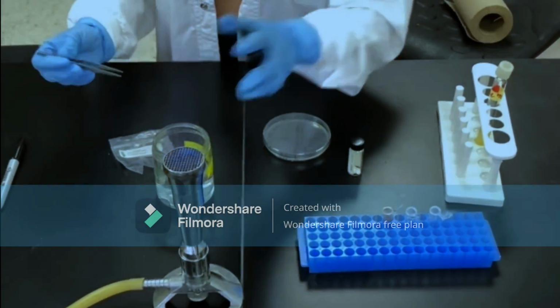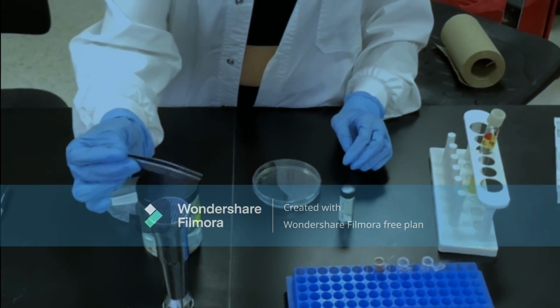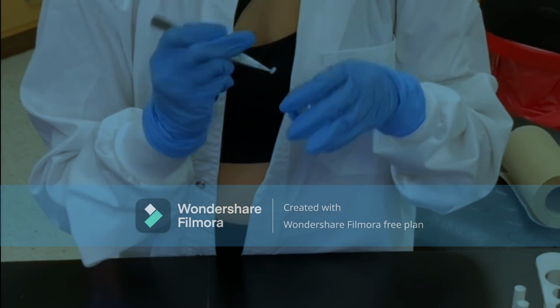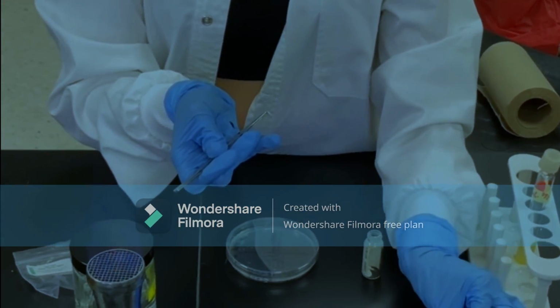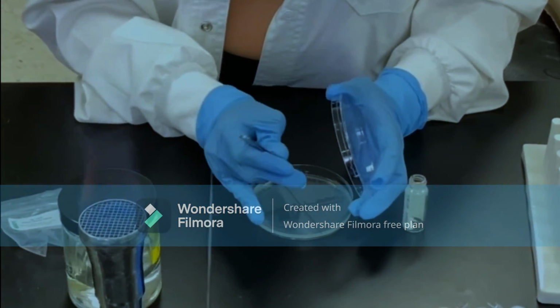Flame sterilize the forceps and make certain the ethanol has burned off completely and allowed to briefly cool. Pick up a disc carefully, dip it halfway in the treatment created, and place it on one quadrant of the plate. Tap lightly on the disc to ensure it stays in place. Remember to use a flame to sterilize the forceps between each disc placement.